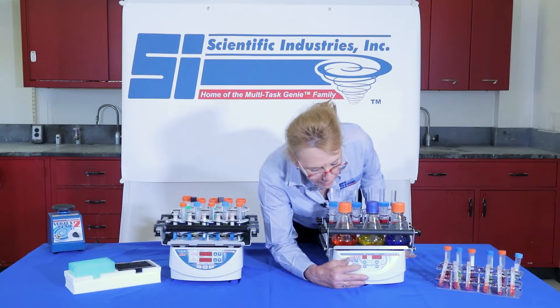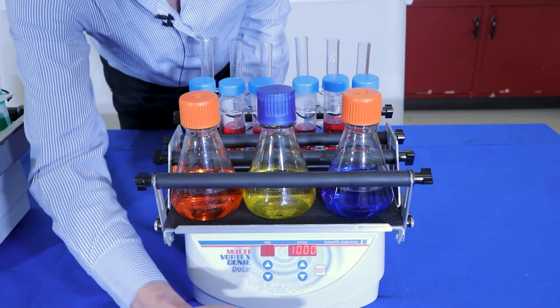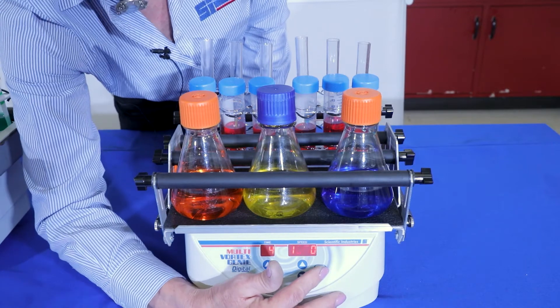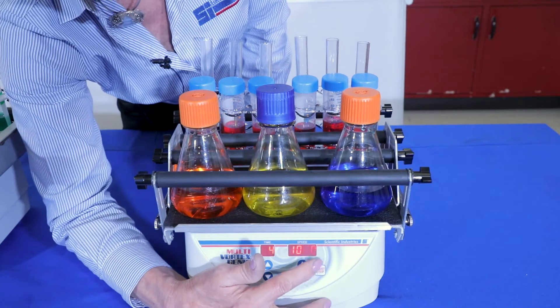So let's turn these on. Press it to engage. Let's set the time for four minutes. Maximum speed at 1,000 RPM. We'll turn that on.